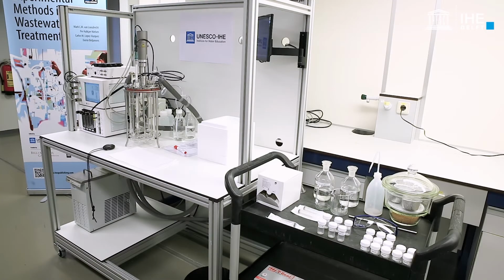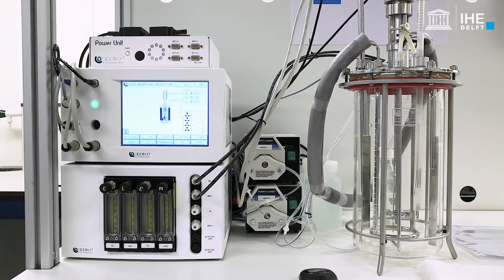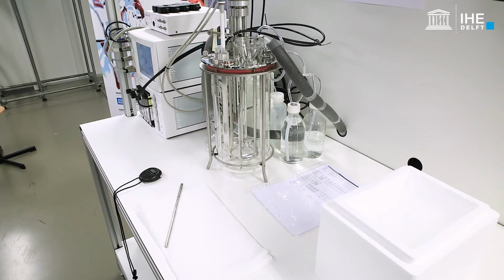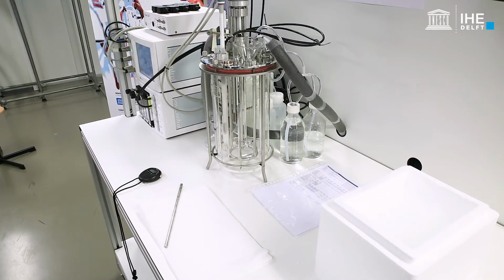This test is performed in one aerobic reactor. Prior to the execution of the test, verify that your setup is ready and that your pH and dissolved oxygen meters have been calibrated. Place all your working material next to your setup to ease the conduction of the test.